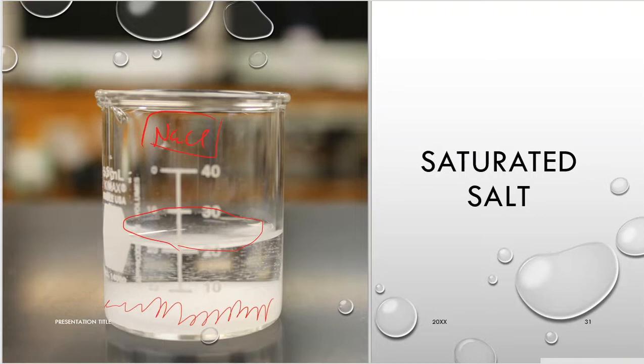And that is a very easy way to make saturated solutions in a lab. I don't need to weigh out anything. I don't need to measure anything. I just eyeball it, folks. I use my gut. So a little bit of water, add salt, add salt, add salt, until no more dissolves and it just settles on the bottom.